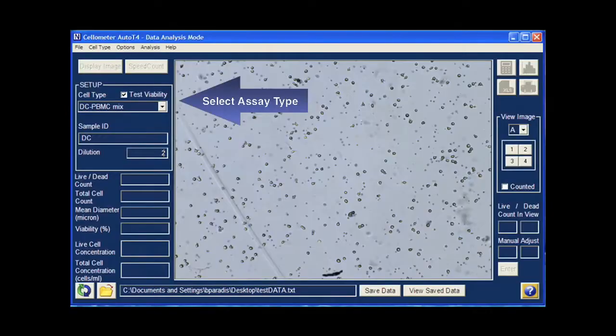After selecting the assay type and entering the sample ID, the brightfield image will appear on the screen. After focusing, click count.